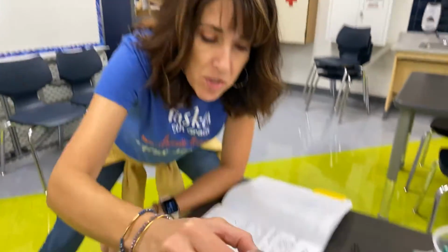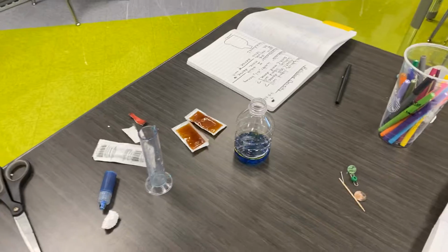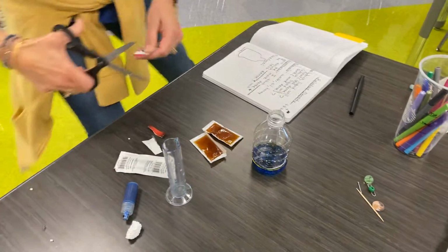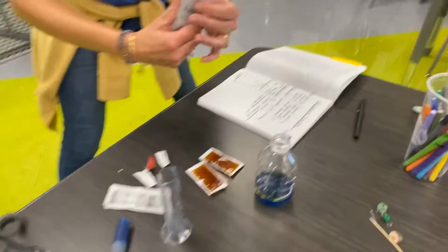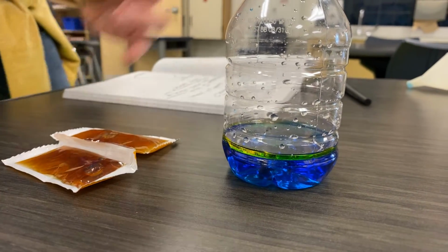And I'm going to put in one more oil so that y'all can see it just a little bit better. It's hard to get this little guy to come apart. Whoa. Okay, here we go.